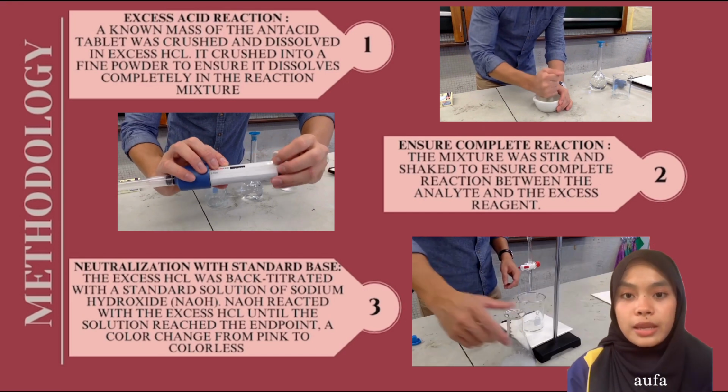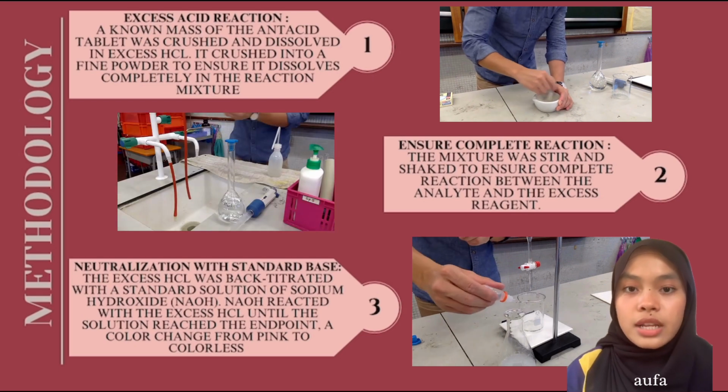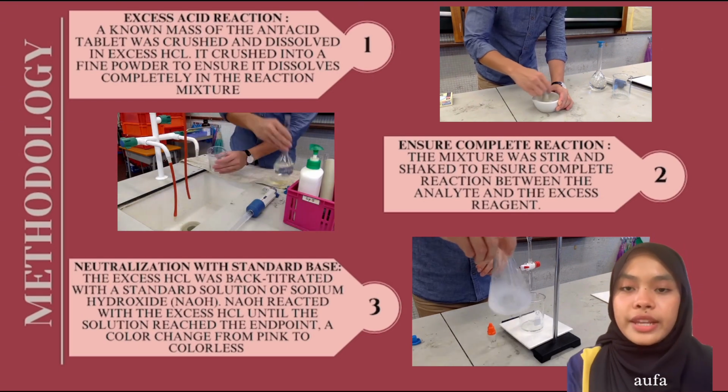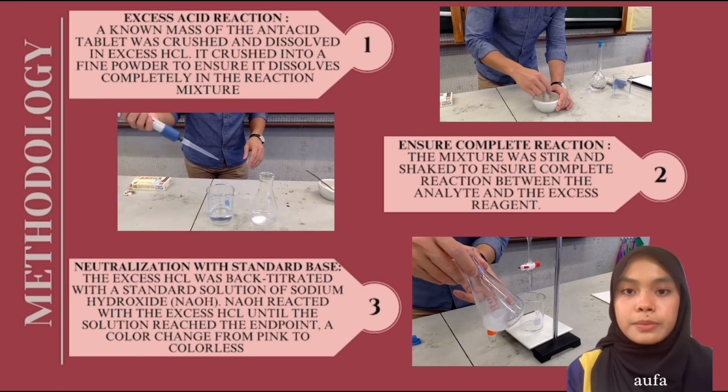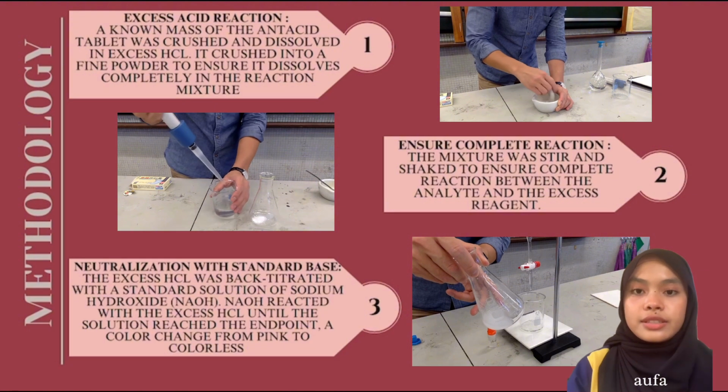The calcium carbonate in the tablet reacts with the excess hydrochloric acid, forming calcium chloride, carbon dioxide. Next is to ensure complete reaction. The mixture was stirred and shaken to ensure complete reaction between the analyte and the excess reagent.